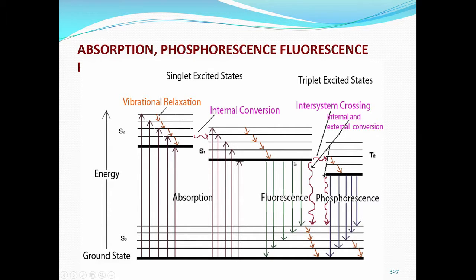What happens is from here there is one more stable energy level which is not exactly an excited electronic energy level, but slightly lower, and having a definite corresponding energy. So, the molecules will not only come to S1 as in fluorescence, but they proceed further down to T2, and then the emission occurs at different wavelengths just like fluorescence.